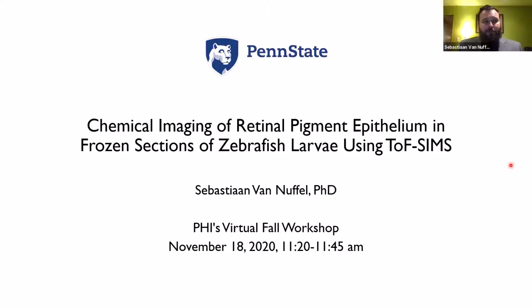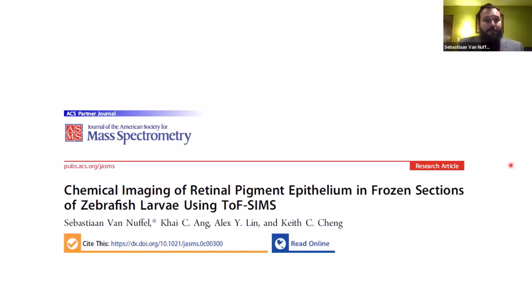First, I would like to thank the people from Physical Electronics for inviting me to give a talk during their virtual fall workshop. The topic of my talk will be our newly published paper in the Journal of the American Society for Mass Spectrometry, titled Chemical Imaging of Retinal Pigment Epithelium in Frozen Sections of Zebrafish Larvae, using time-of-flight secondary ion mass spectrometry.